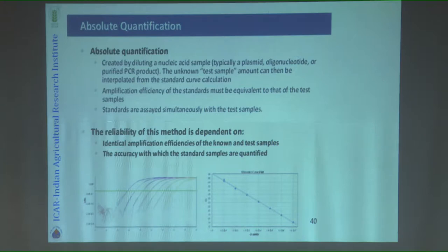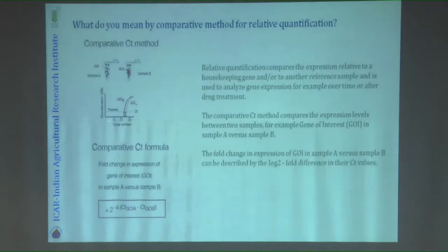What you need to do is take care of identical amplification efficiencies. What you are measuring and what you are using as a standard should be of the same kind. Otherwise, they will have different amplification efficiencies. The accuracy with which the standard samples are quantified is very, very important. So we need to know how you can prepare a standard curve.